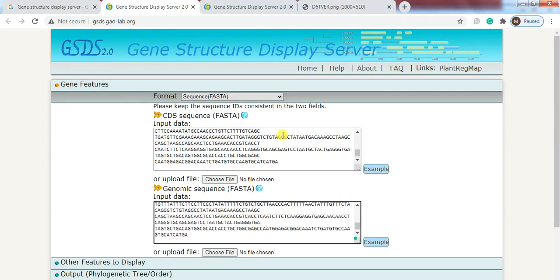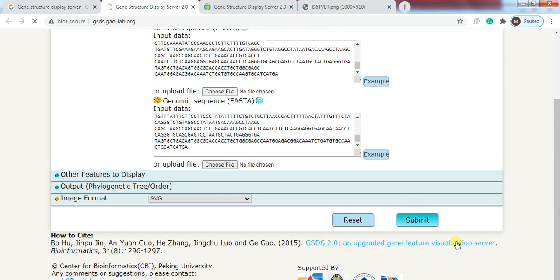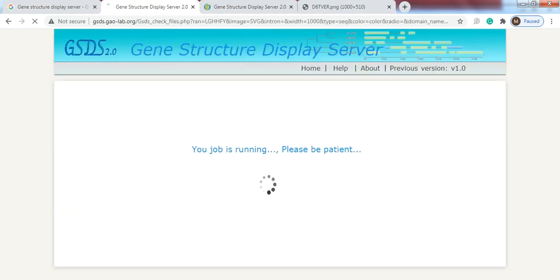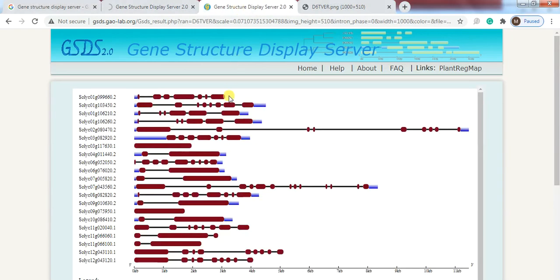After putting the data in their respective box, go to submit. When the job is completed it will appear in this form.